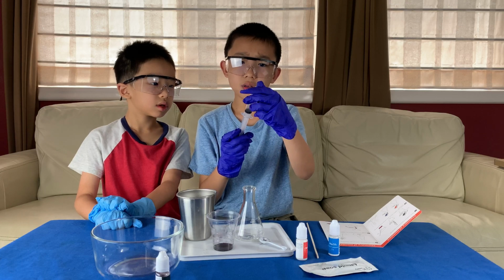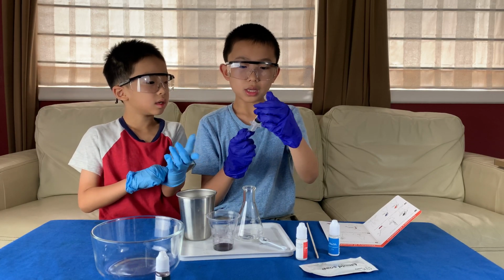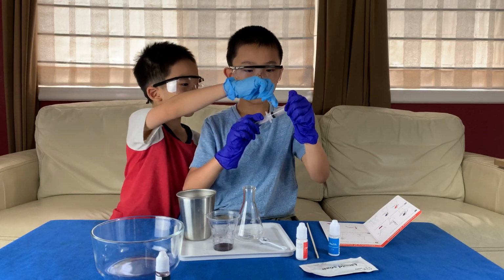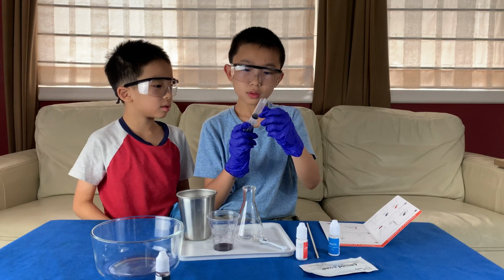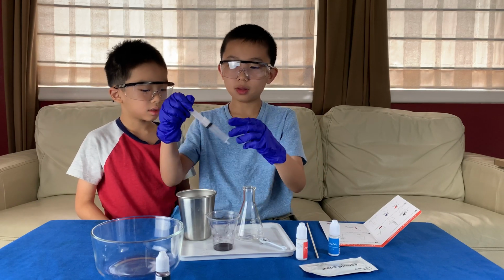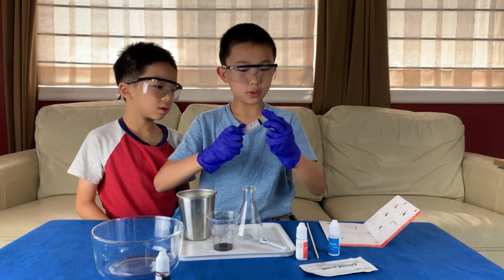Let's see. Oh, that means 10 and 10. Two times, 10 and 10? So make it until it's at the 10 mark and then do it 2 times. Oh, yeah. Okay. So, we're going to need to do this twice.